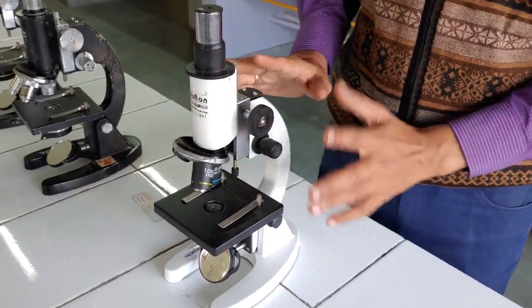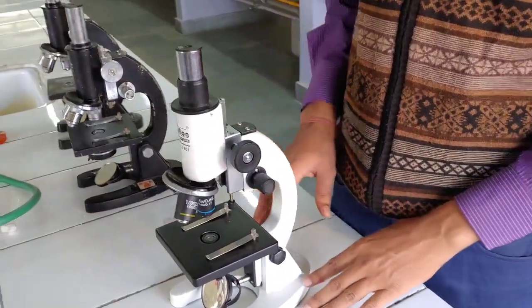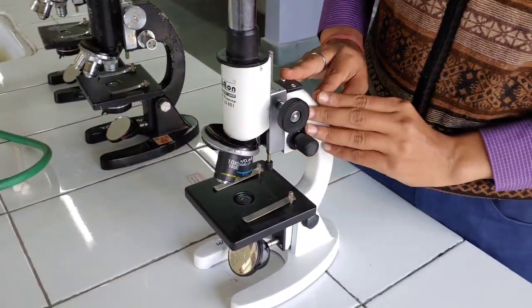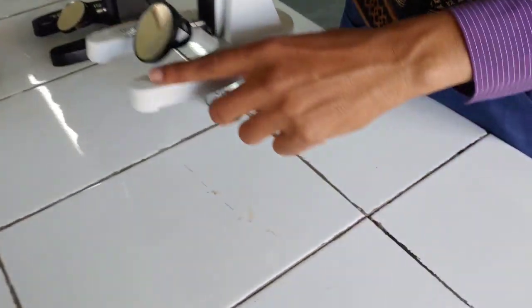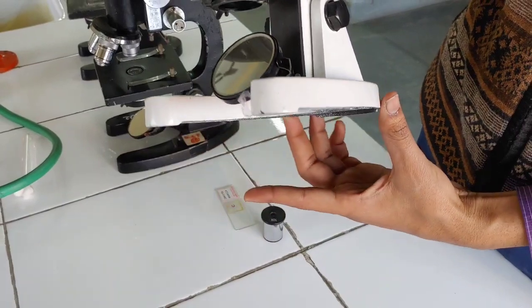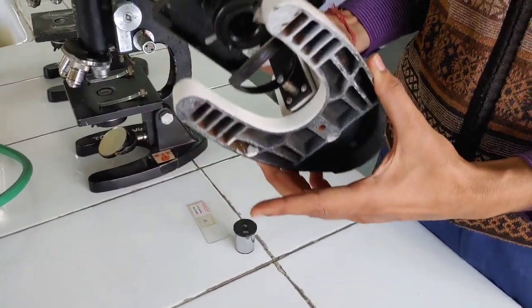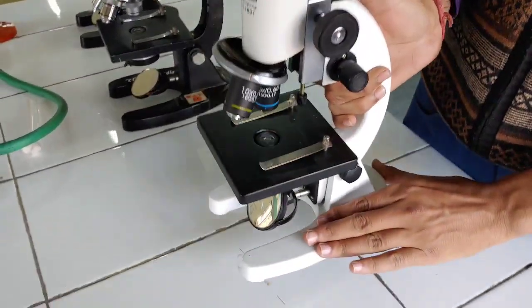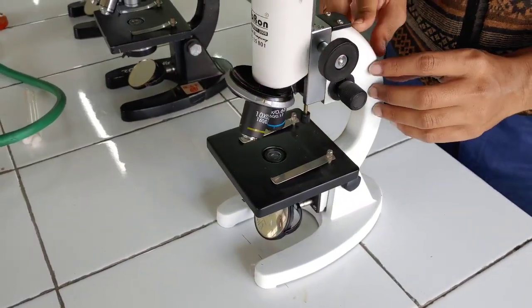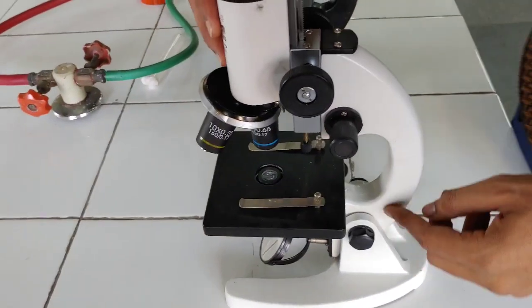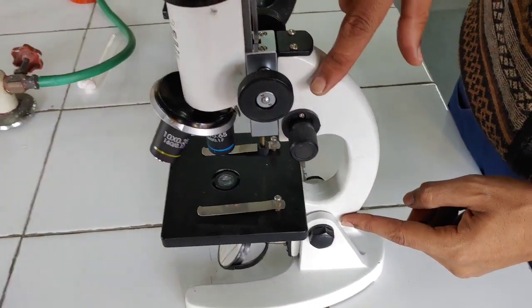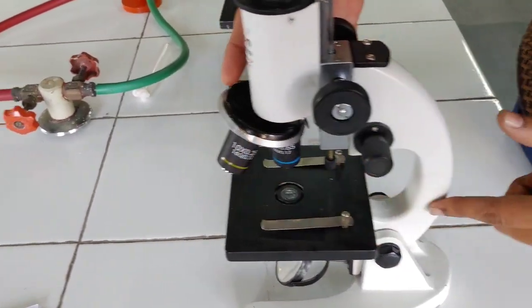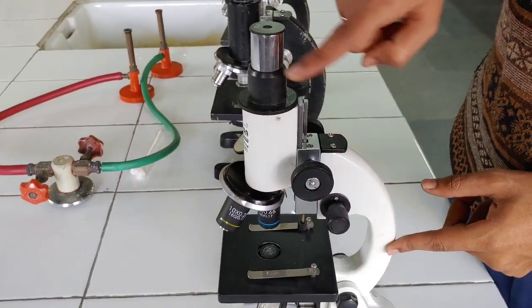Now you need to know each and every part in details. So first within the support system, first is the base of the microscope. That is the base of the microscope. What is the function of this? It is a horseshoe set and is the base on which the microscopes rest. Next is arm.